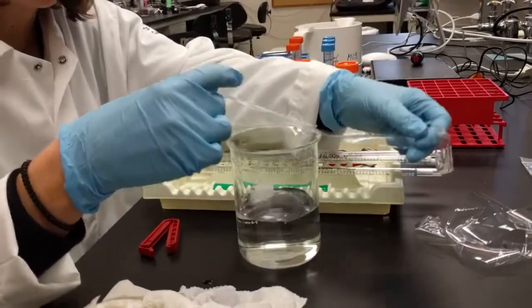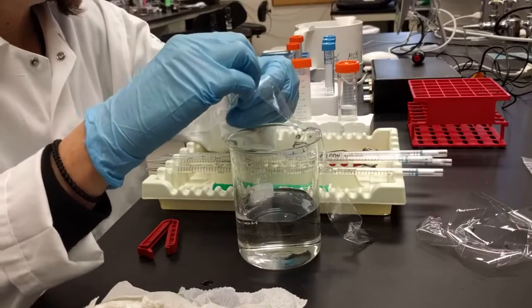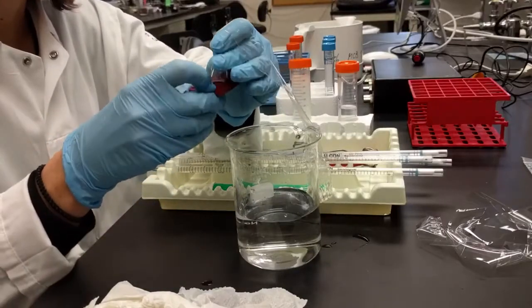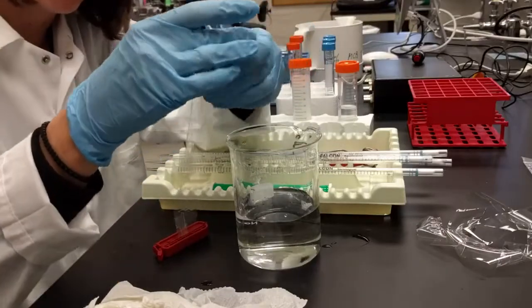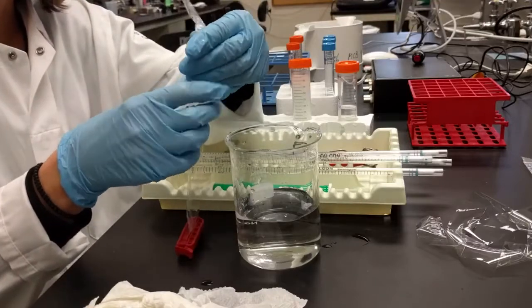And on one end, I'm gonna fold it back on itself and then clamp it off so that we don't have any leaking. Like that. And then on the other end, I'm just gonna rub it between my fingers to open it up. Okay, so the bag is now open. All the way down.